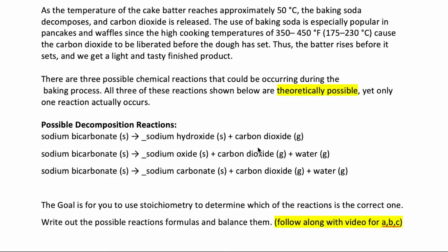Okay, so when we do our measuring, what we're starting with is this solid, and what we're going to end with in our test tube is one of these solids right here. Okay, this stuff right here, this is all getting released to the environment. So it's not going to be included in our mass. Not that it went away, it just got released to the environment. Okay, we didn't collect that.